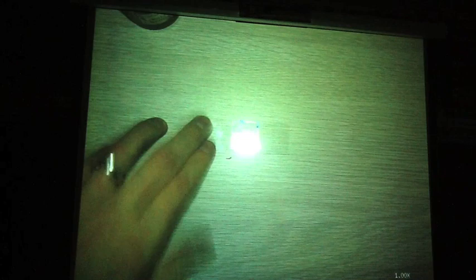That's important. So here is the sample for the onion cell with water, sorry. And here is your sample of an onion cell with methylene blue. Here is my sample with cheek cell, just with water mount. And a sample here that is cheek cells once again under methylene blue. So you're gonna have four different samples to prepare.